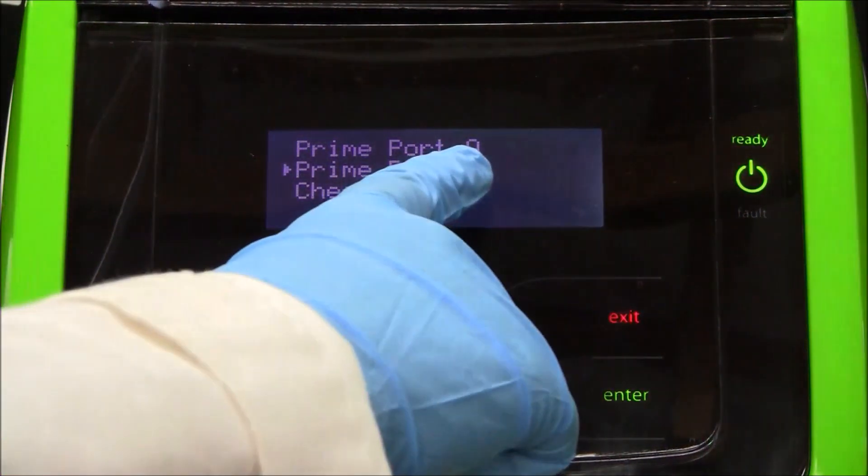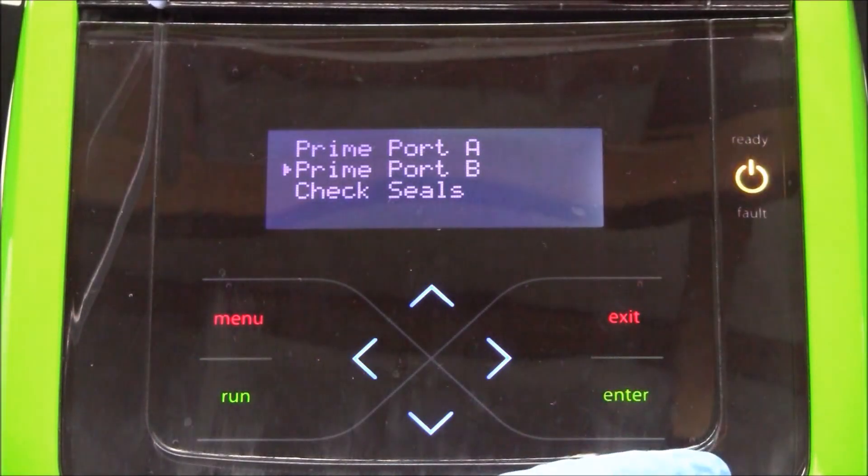Now prime port B three times. This will fill the line with the blank solution.